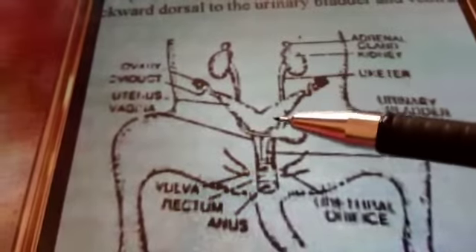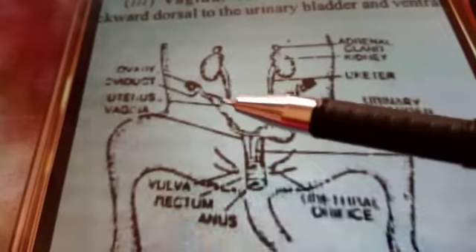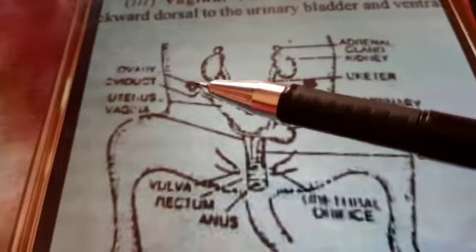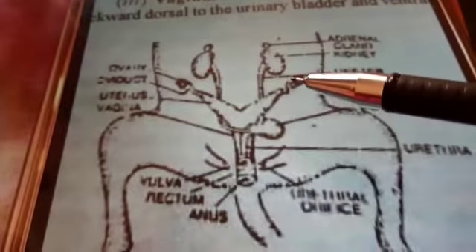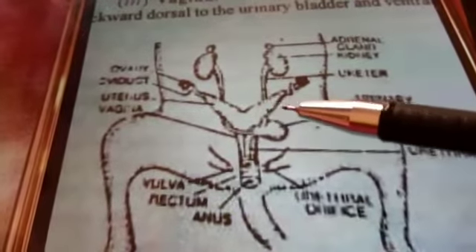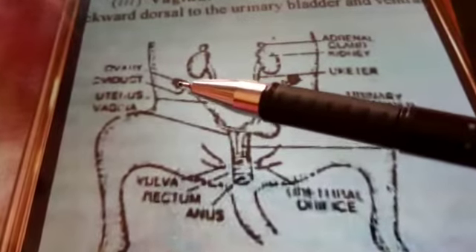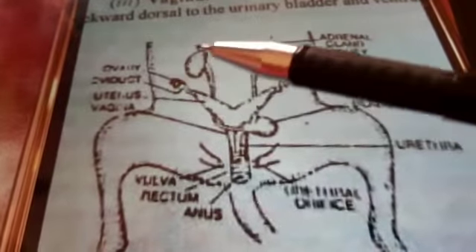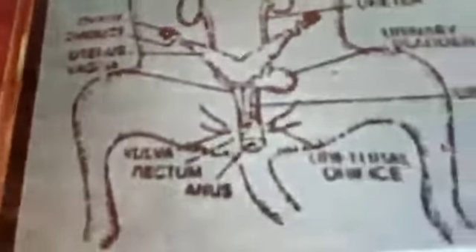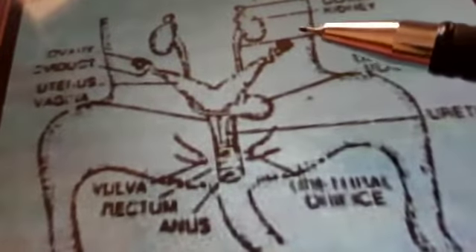Before we start, a few things are common, as we did in the case of pigeon and uromastyx. In the pigeon, which we did yesterday, we had only a single ovary, but in this case we have two ovaries and two oviducts. Now each oviduct is not attached to the ovary. It is always like this: the ovary lies suspended or attached to the body wall, and as I have already told, the peritoneum which attaches the ovary to the body wall is termed the mesovarium.